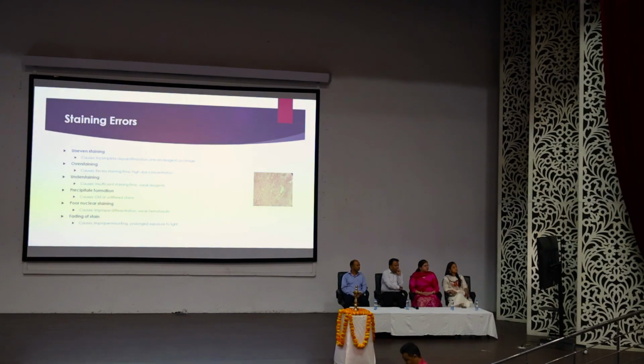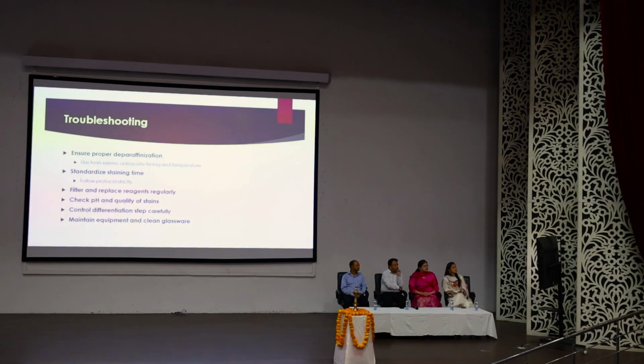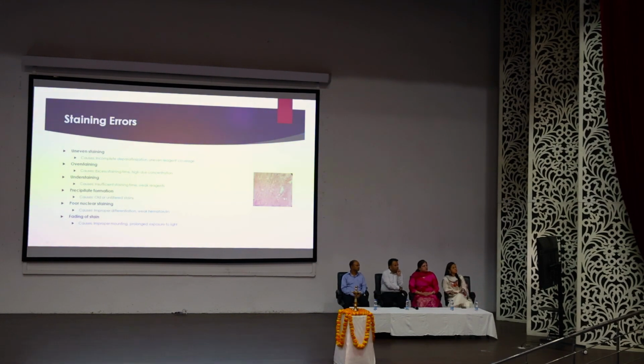The next one is fading of staining. Improper mounting and long exposure to light cause fading of stain. You can see the image here. This is because of the retention of wax here. We cannot see a clear image in this section.